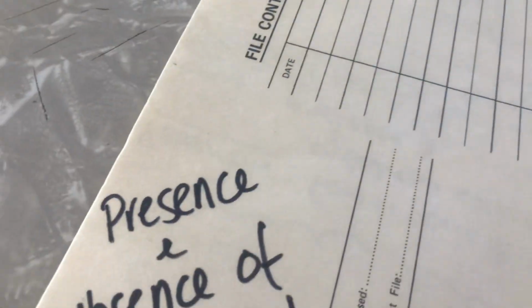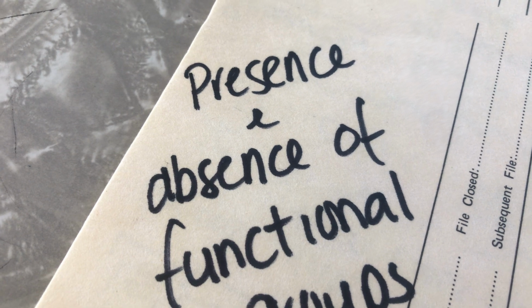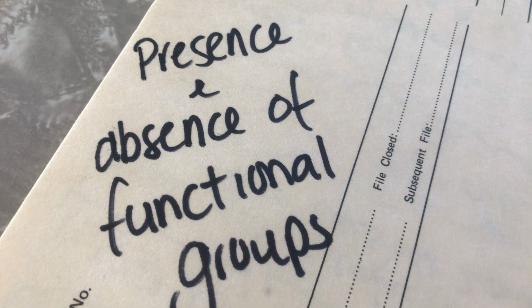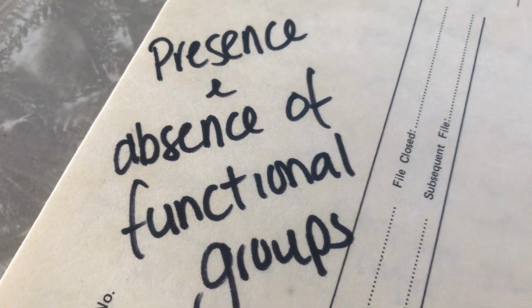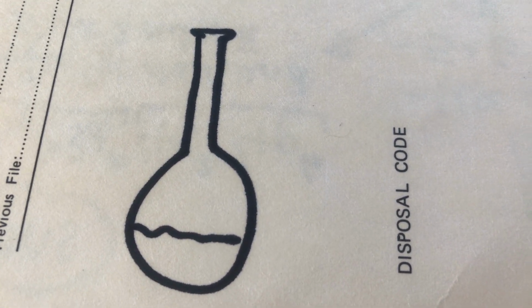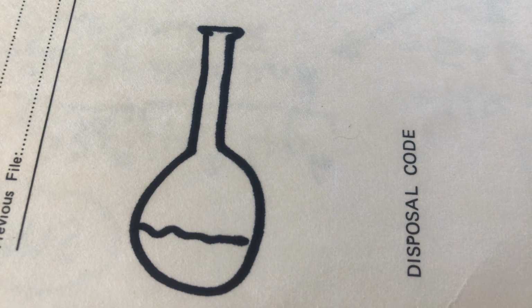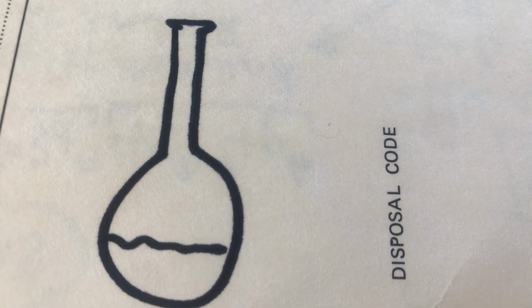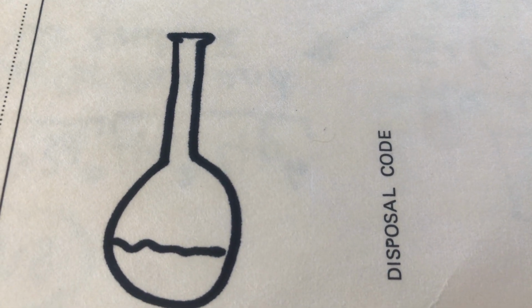Right, welcome to the first video on the first spectroscopy technique, and this one is infrared spectroscopy, or IR for short. The purpose of this type of spectroscopy is to identify the presence or the absence of any functional groups. How it works: we have a wee sample and we want to know what we've made, or what sample we have taken from the scene of the crime. Probably not, but let's give that a go.